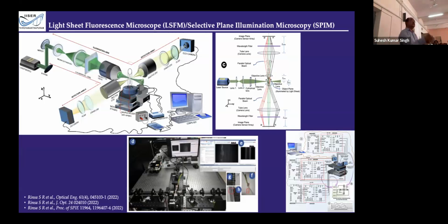So the idea is that we can get two fields of view with different magnifications or resolutions. When the field of view is large, the resolution is spread out. When the resolution is very high, then the field of view is very limited. So when we are trying to see an object with microscopic resolution, we lose the field of view, on the order of millimeters. Side by side, whether we can see the field of view, and this has a biological implication, yes. When we are studying microscopically a certain cell, what are the connections with the surroundings and the response from the whole body, that we lose.